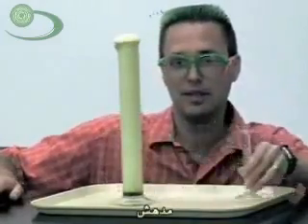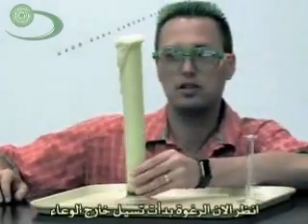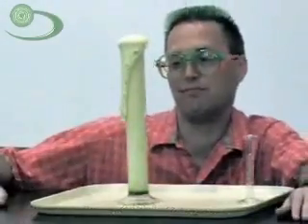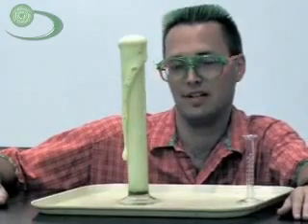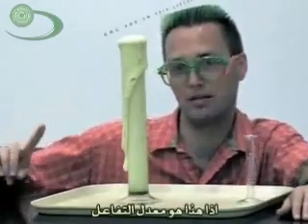Classic. Maybe I'll go, oh here, look. You can see it foaming over the side, huh? Beautiful. 3% now. Still going. So this is a reaction rate, right?